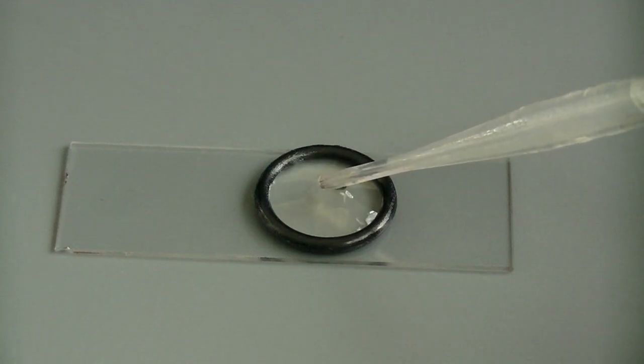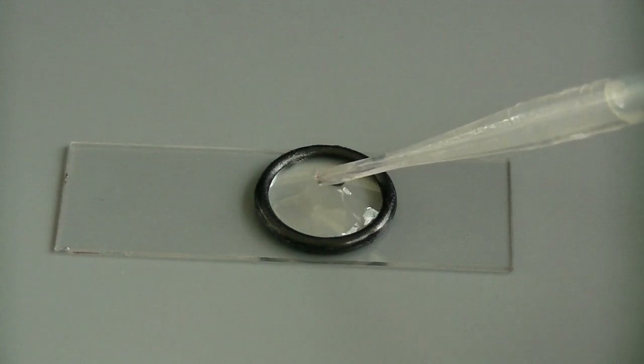You need to fill so that the liquid is just bulging above the O-ring held there by surface tension.